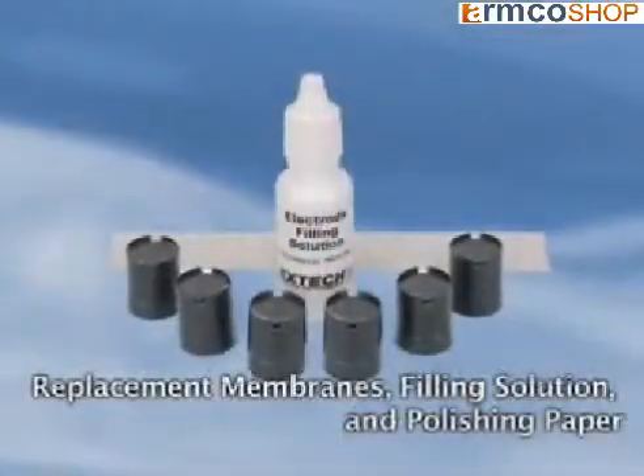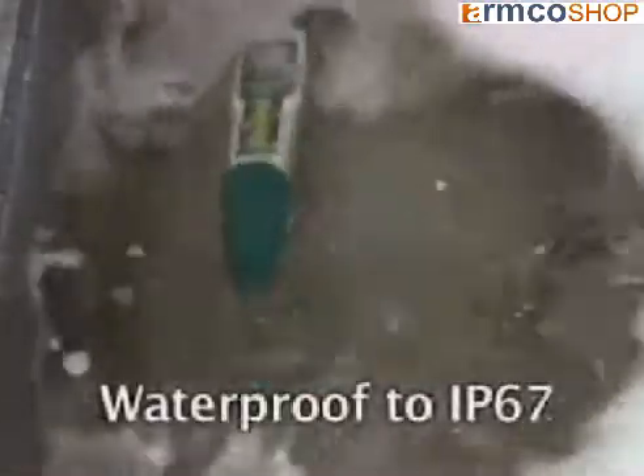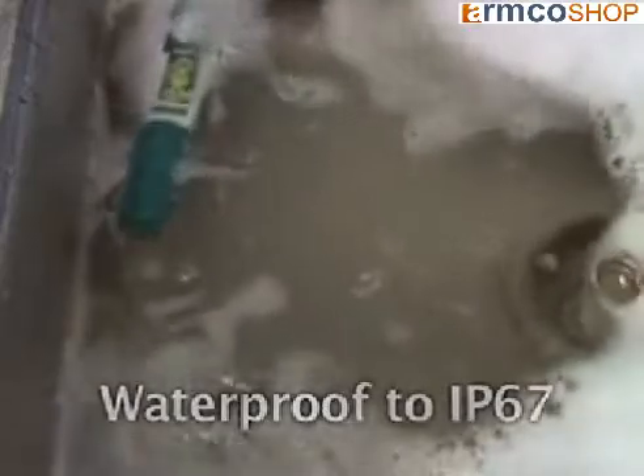Replacement membrane kits are available. The meter is designed to be waterproof, meeting the standard of IP67. This assures safe and accurate measurements, even in extremely wet sampling conditions. And it floats.